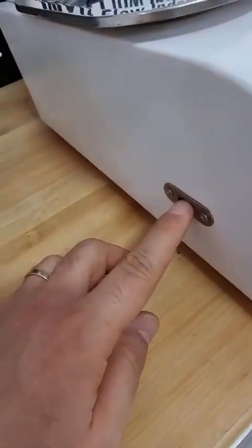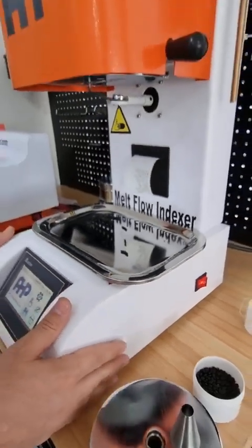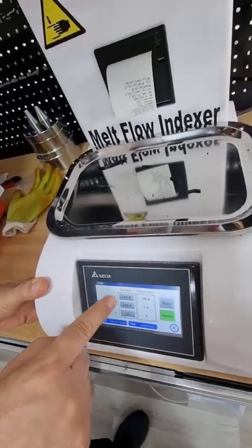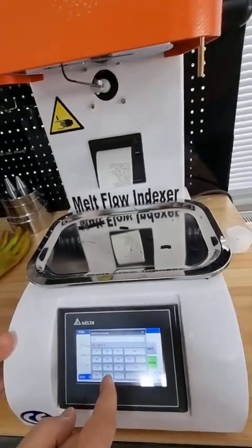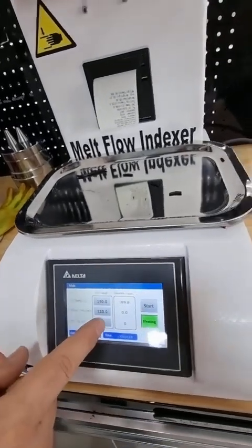It also has a USB data output for exporting data to Microsoft Excel on a computer. First of all, you need to set the temperature. The temperature setting is here — it is 190°C for polyethylene and 230°C for polypropylene.